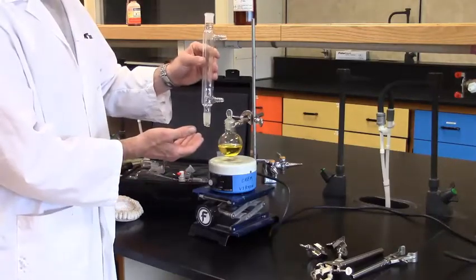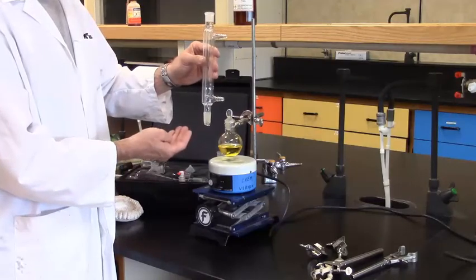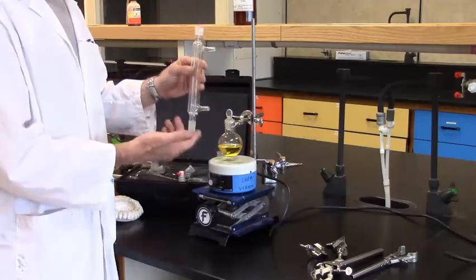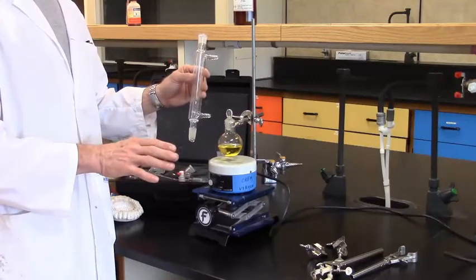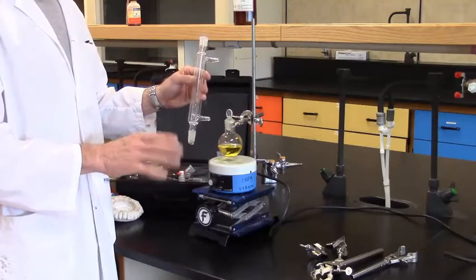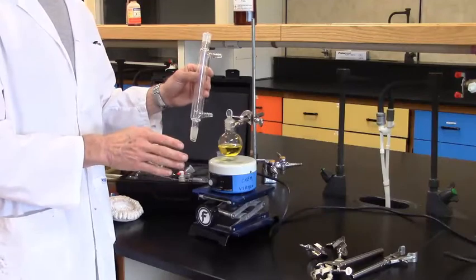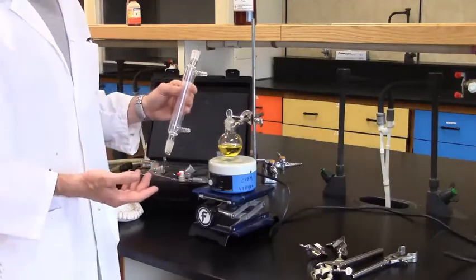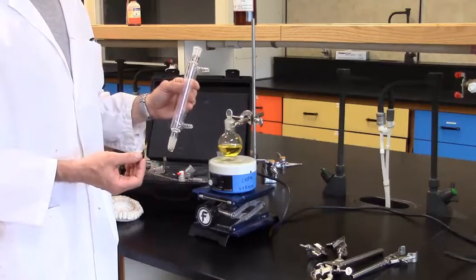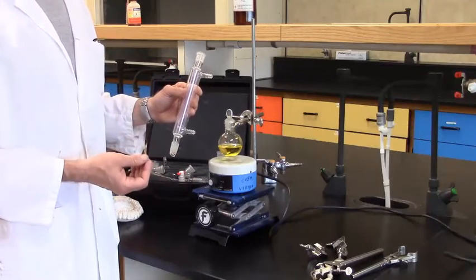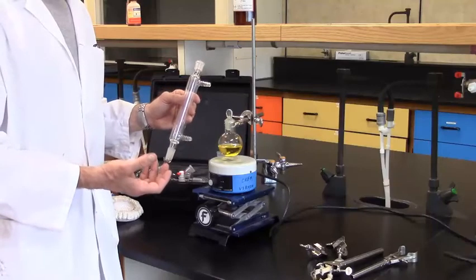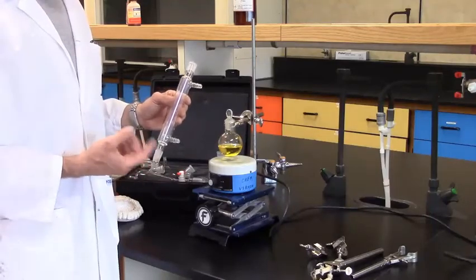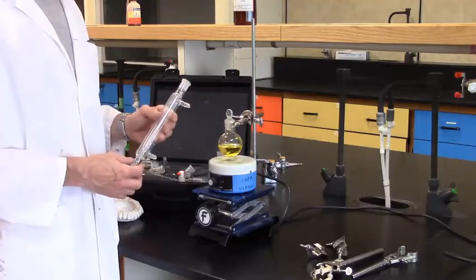Once I set up a reflux apparatus, I can heat it and walk away, being assured that if it's boiling, it is exactly at 38 degrees Celsius. No warmer, no colder. If it's refluxing, it's at 38 degrees Celsius. Other solvents, having different boiling points, methanol, ethanol, etc., have their own distinct boiling points, and that's the beauty of reflux. It's a very simple heating process, and it guarantees the temperature is maintained at a very specific temperature, which, without that, is quite a tricky process to achieve.